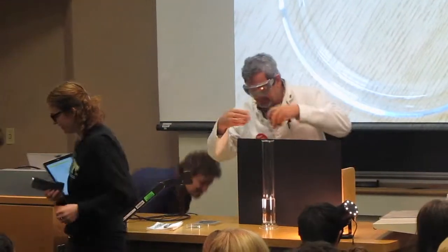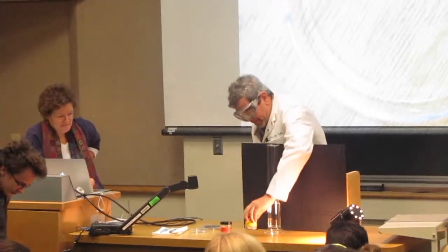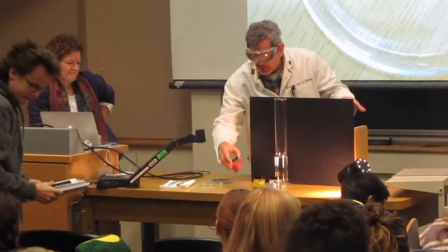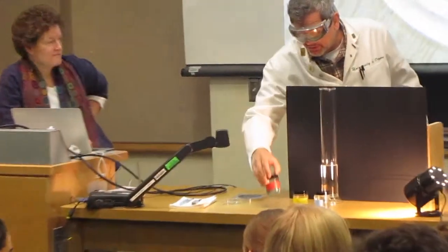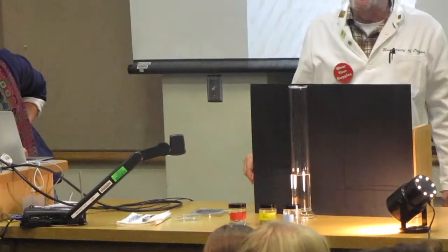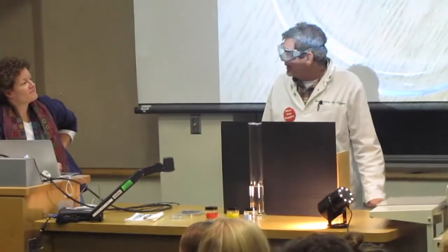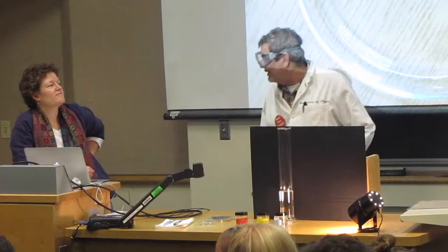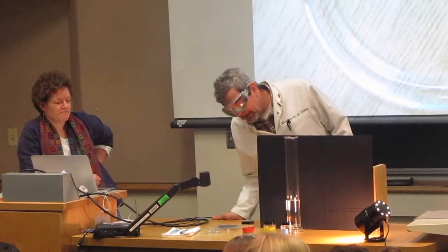So there's lithium, sodium, and potassium. I store them under mineral oil because they are quite reactive. They'll react with oxygen in the jar, and oxygen that diffuses into the jar. If I leave them there without mineral oil, they'll come back in a few weeks, and I'll have lithium oxide, sodium oxide, and potassium oxide. Actually, probably lithium hydroxide, potassium hydroxide, and sodium hydroxide.